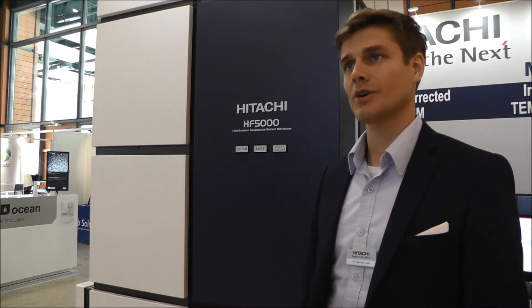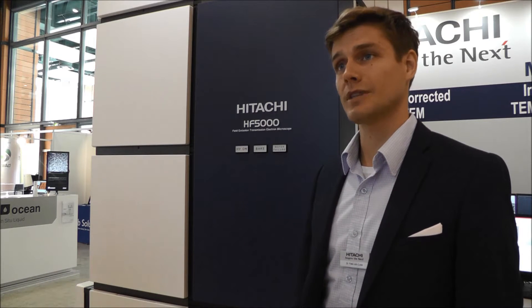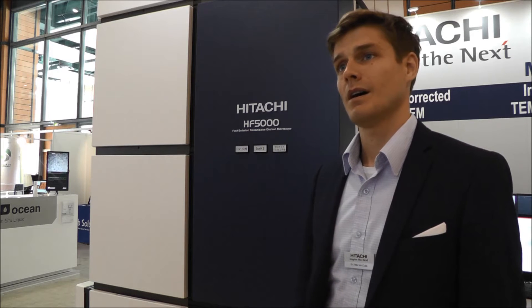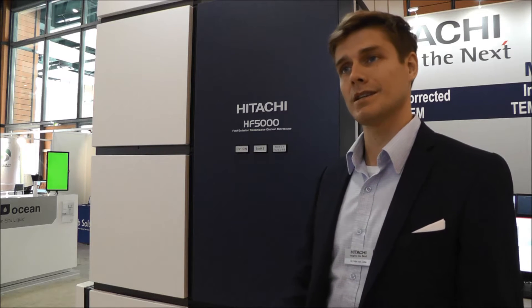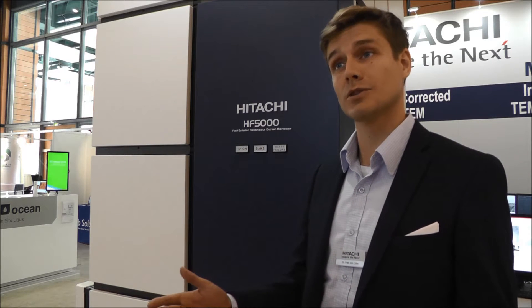Sure. We will bring onto the market next year in April 2017 a new STEM-TEM. It's going to be a STEM-corrected machine. The basic idea is to have a very easy user interface, so that it's accessible for multiple users.